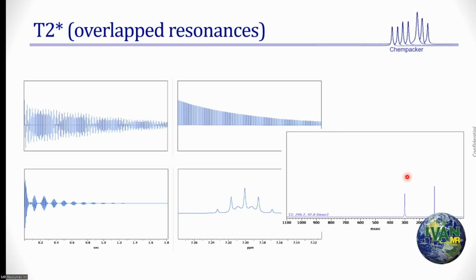And so when I do a T2 star spectrum, I'm just plotting the decay rate as a T2 star on the bottom. I'm just taking the same table and saying, don't bother with my frequency. That's zero, I know, because I just said all phases are equal. Frequency has no meaning, but plot the T2 star. And then it plots up and says, hey, you have two T2 stars in there. In this area, there are two T2 stars, no CPMG done. I'm able to find both.